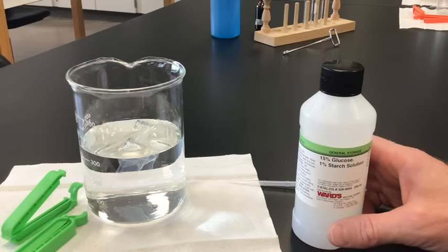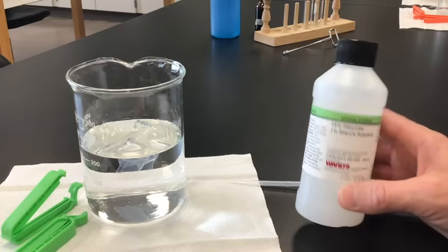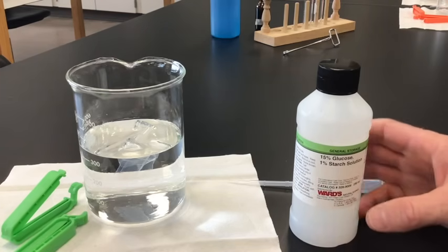Large molecules won't pass through the membrane, whereas smaller molecules will. So we're going to see how glucose and starch are able to — or not able to — diffuse out of the dialysis tubing.